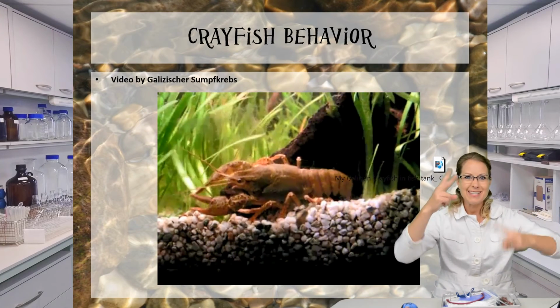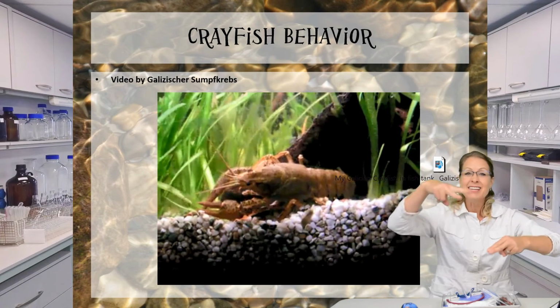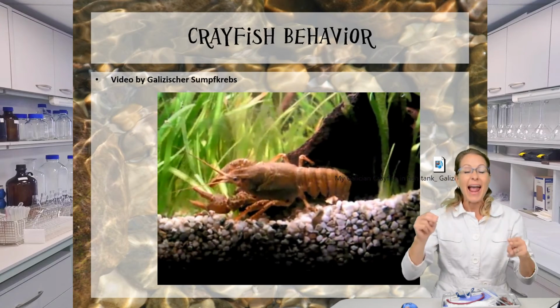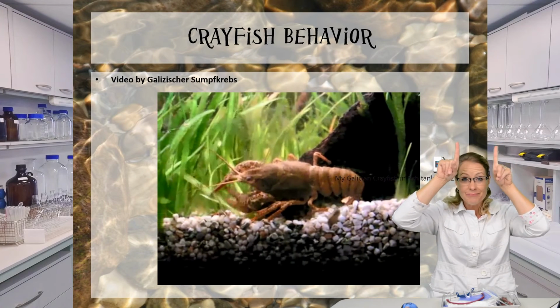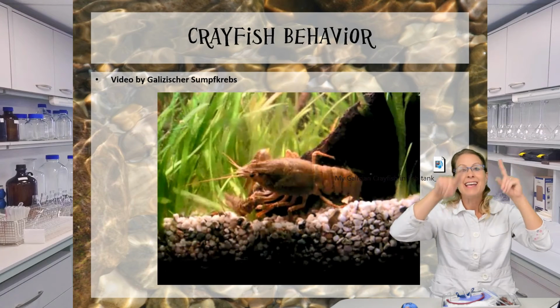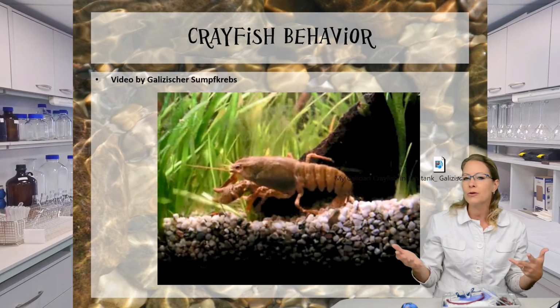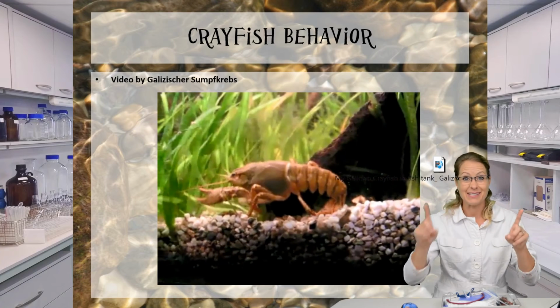He also has these big 2 tools in front of him, kind of like hands, and he uses these big pinchers to move things around. And he has some things coming off of his head. Do you know what those are? Not antlers, they are antennas. And they use those for smelling and feeling and sensing how fast the water is going. So it's really important to feel things with those antennas.